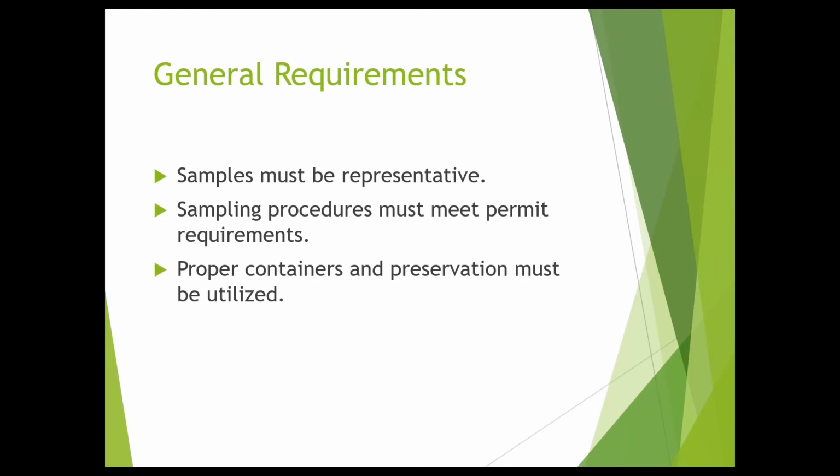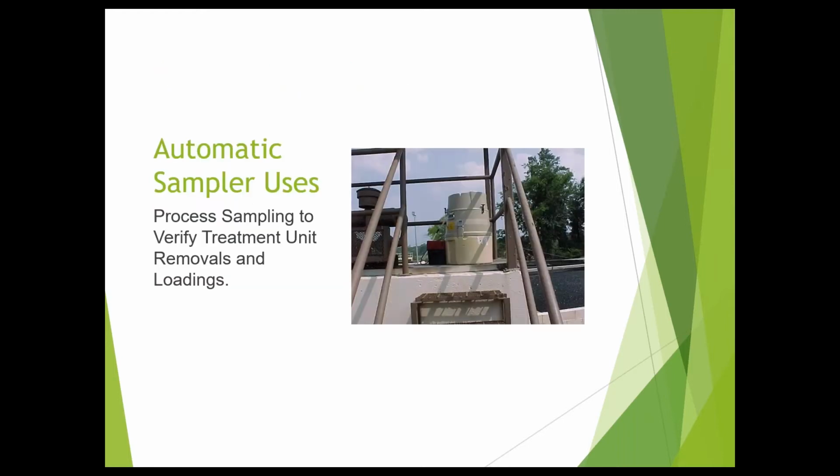So, general requirements. Samples must be representative, they must meet the law, and they must follow the standard methods, which is akin to, again, meeting the law. Automatic sampler uses, same thing as grab sampler. Automatic samplers just save us time, save us energy, save us manpower.